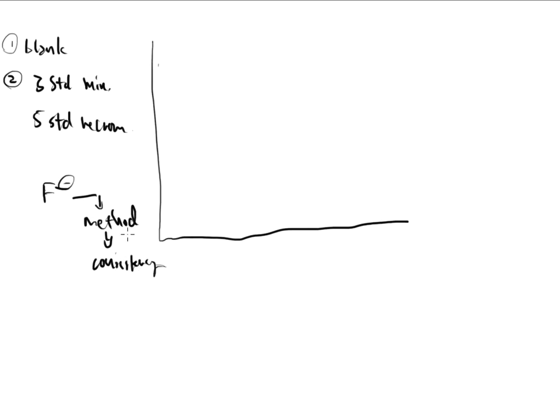Someone has made the determination what proper ranges should be present, and then they want you to do those same concentrations every single time for consistency. So someone that made a calibration curve 6 months ago, you can remake those standards today, and you can run those standards today and just replace the data that they made 6 months ago. You don't have to go into the software, you don't have to go into the computer program and change anything as far as the method is concerned. So we're just overriding data because you've made the same concentrations over and over.